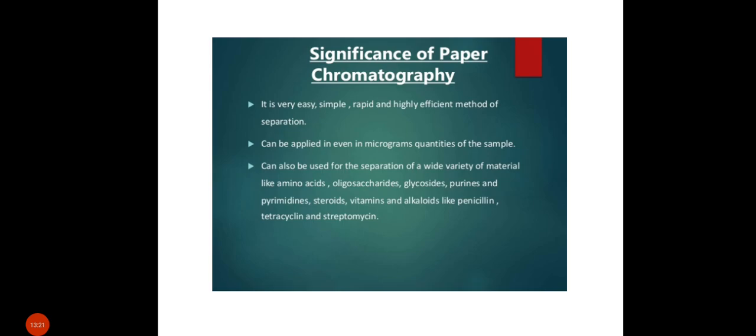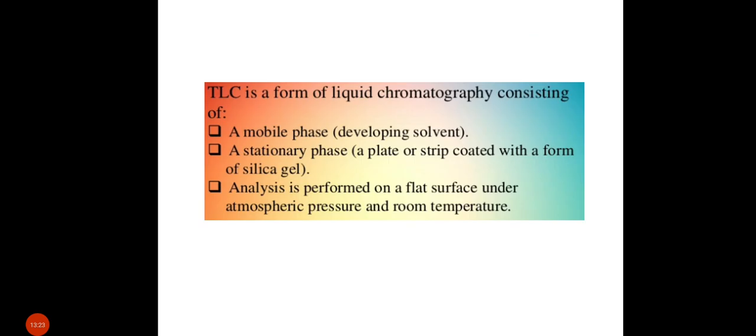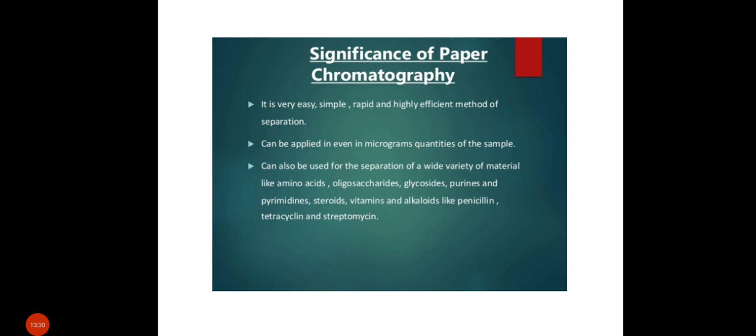Now, in the next lecture, we will see thin layer chromatography: how thin layer chromatography works, and what is the working principle of thin layer chromatography.